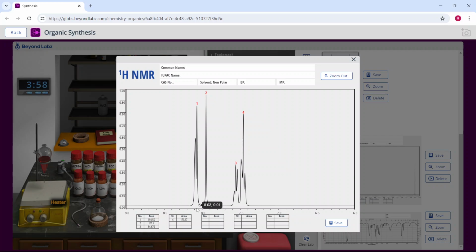The whole scale for the proton NMR is from 0 to 12 parts per million. And I know that the region between 7 and 8 parts per million is for the benzene. Now, for some reason, that singlet for the carboxylic acid, normally in normal NMR, shows at 12 or 11 parts per million because it is a carboxylic acid.